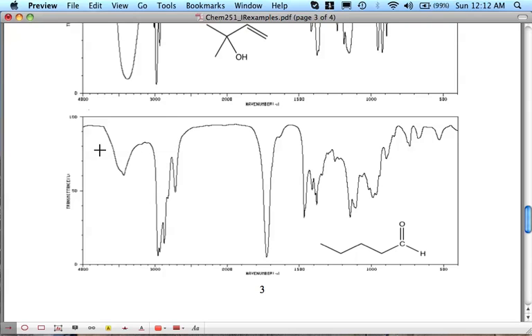What does that look like? Look up here. What do we see here? What was that peak? Remember, that was our OH stretch. This looks like it's coming around the OH or maybe an NH stretch or something like this. This can be very confusing. It's like, what's going on there? In this case, it's an artifact, but it's one that you often see with aldehydes.